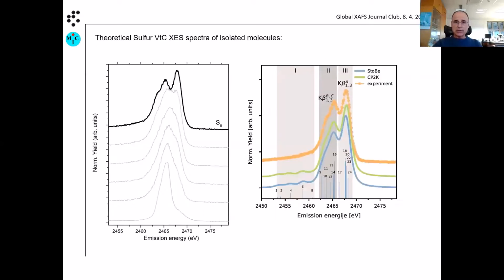Okay, I'm close to the end, so I just want to show the very last work. I'm still in the same range. Previously, what I have shown was, from a spectroscopy point of view, a more empirical approach. But the ultimate way, the best way, is that you need some theory. You would like to interpret your spectra by doing some calculations.